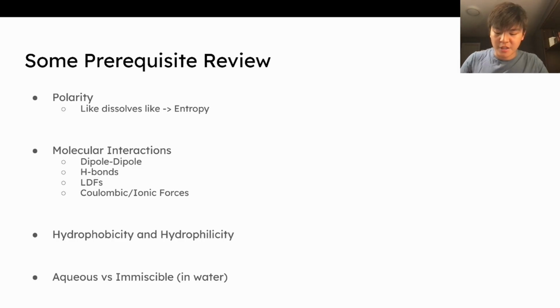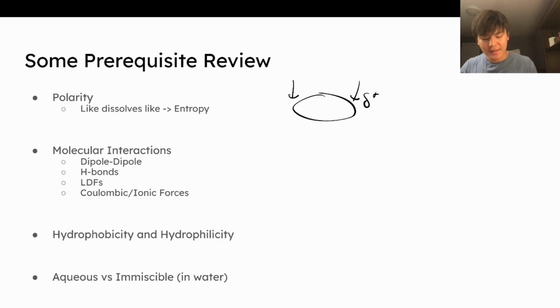So first, we want to talk about polarity. And what exactly is polarity? Well, polarity is basically the net charge on some sort of bond or molecule. It's more so the fact that, for any compound, is one side going to have different properties than the other? That's basically what polarity means. In our case, is this side positive and is this side negative?